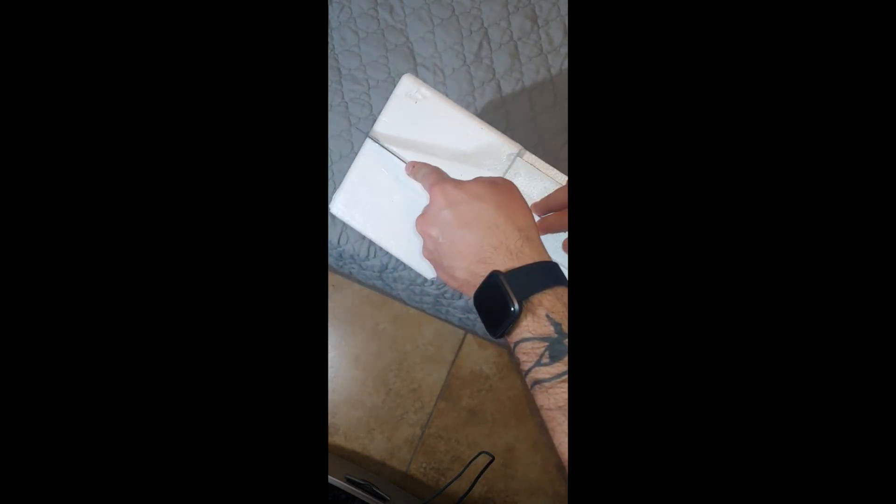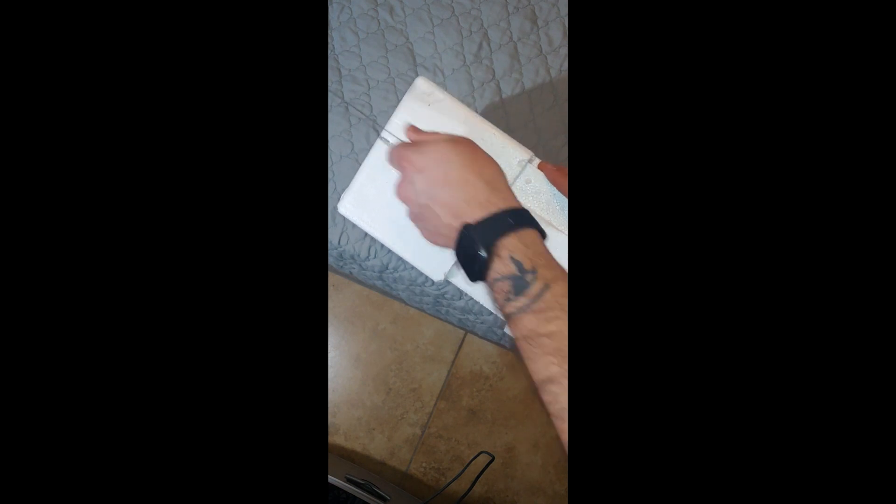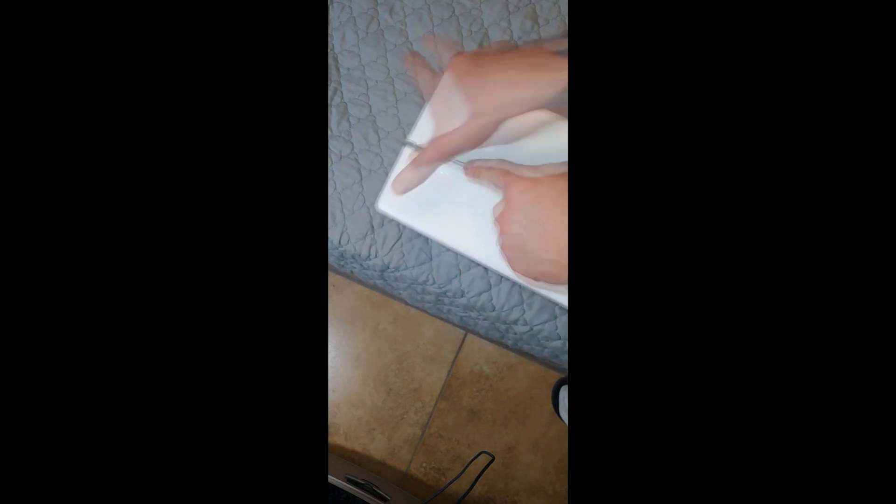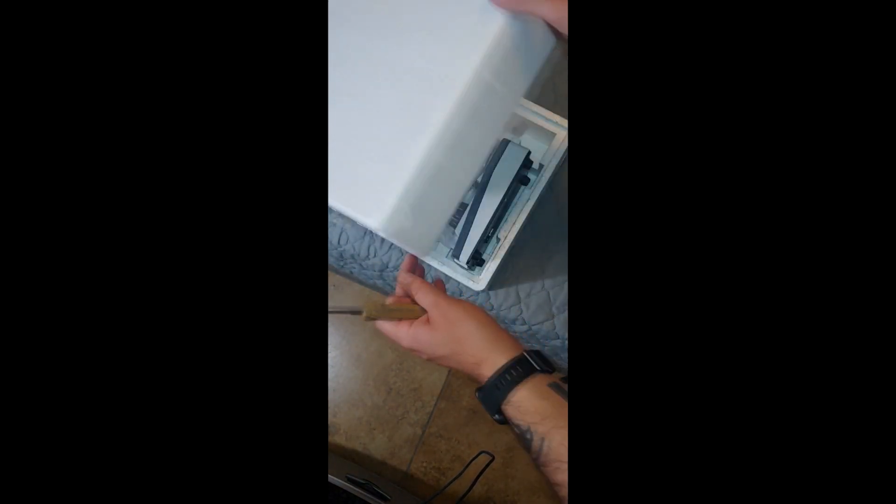So it comes in this little styrofoam box — pretty dope, extra safe. It's taped up and I'll go ahead and cut it all off. Okay, so here it looks like we have — oh, it's got a few things in here, there's some stuff right there.